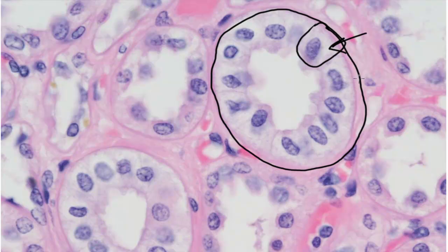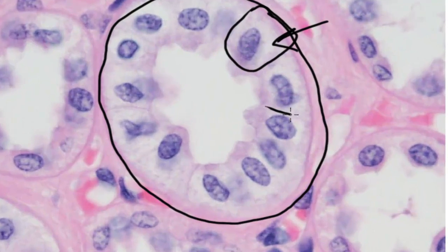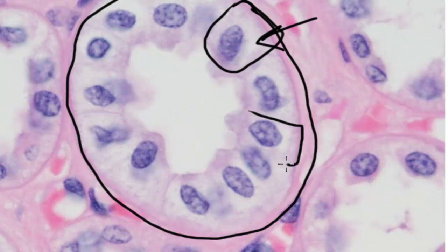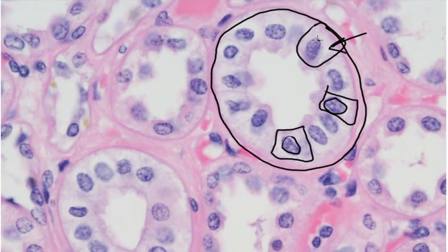I'm going to outline just a few individual cells to give you an idea of where they stop and start. So, here's the one I started looking at. Here's another cell right here. Here's another one here. So, you can see kind of where all these cells are stopping and starting. And you can see, I hope, that the nuclei inside these cells. So, this little guy right here. This guy right here. This guy right up here.